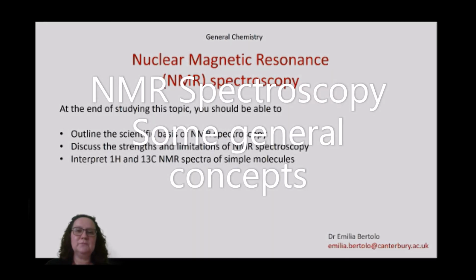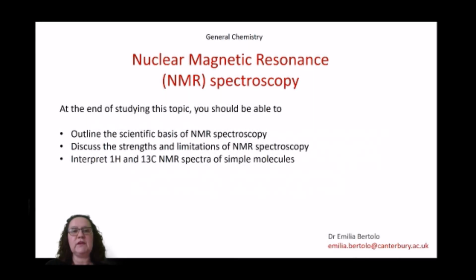Hello everyone, this is the first of a series of videos dedicated to nuclear magnetic resonance spectroscopy. Over these videos we will be looking at the scientific basis of NMR spectroscopy, and we will also look at how an NMR spectrometer works. We will discuss the strengths and limitations of NMR spectroscopy.